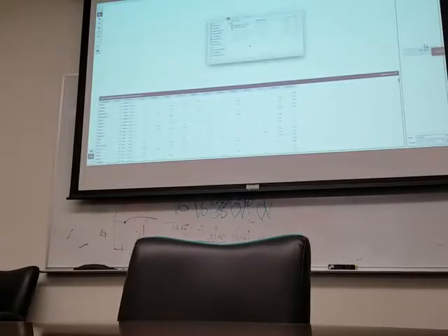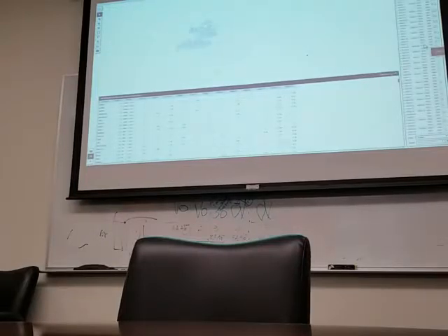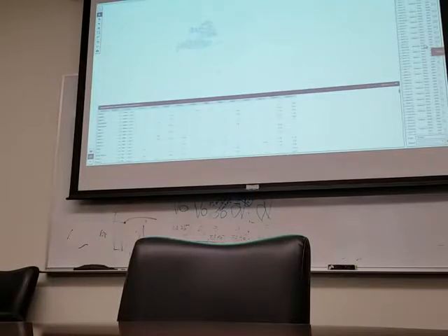Then what I was going to do is import it into MATLAB and essentially cluster them. I'm going to concatenate the heavy V, the heavy J, the light V, the light J, and the CDR3 length of the heavy, and then put everything into a bucket. If there are multiple rows in that table per bucket, that means that the CDR3 similarity was not exactly 100%.